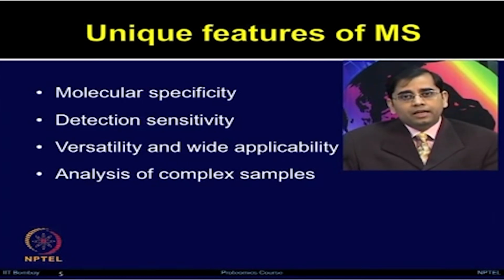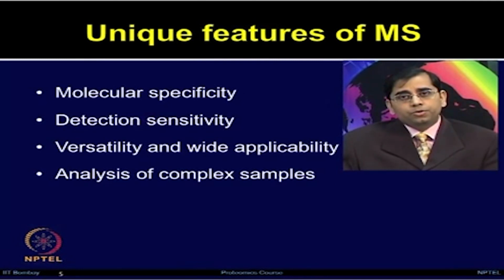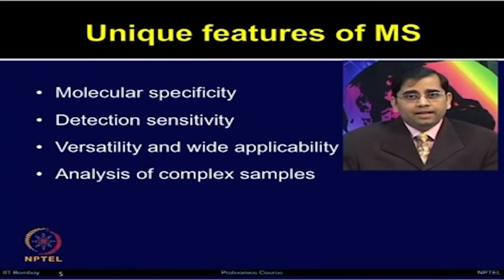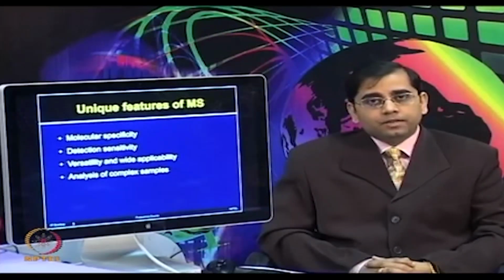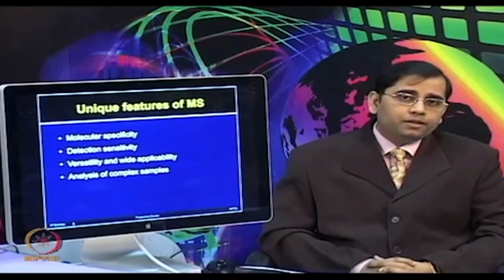It provides a versatile platform to determine the structure of compounds, and it is applicable to all the elements and all types of samples, whether volatile, non-volatile, polar, non-polar, as well as solid, liquid or gases. So, analysis of complex samples such as the proteome is very much possible by using MS.